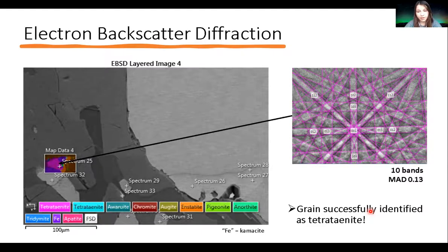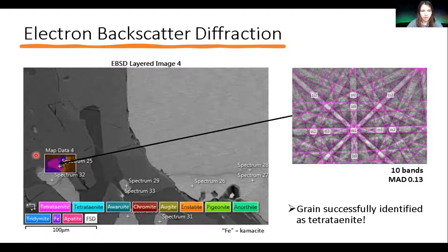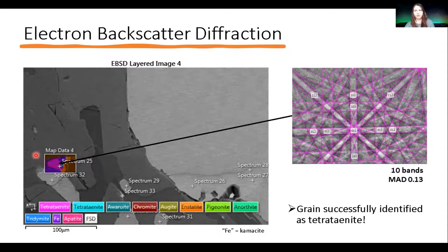EBSD was then applied to get structural information on the crystals, and they were all successfully identified as tetrataenite — which is great. Here is a tiny EBSD map (shown for timing constraints) of one of these grains.